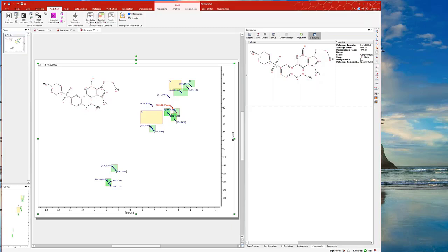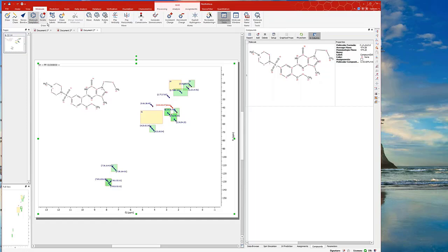And of course, we can try different ones. For example, if I go to molecule, I will remove another one. Actually, I have another isomer included, but since the time is getting close, I'd rather skip that one. Okay, so this gives you an idea. You can have regioisomers and compare with your HSQC and give a rough ranking of which one is more compatible.